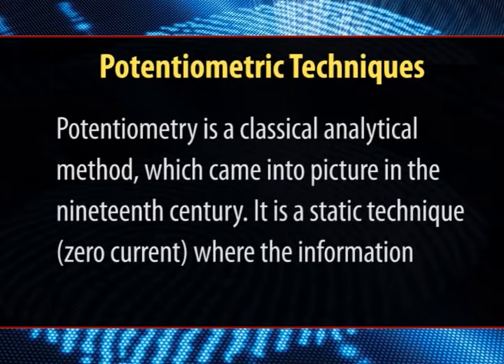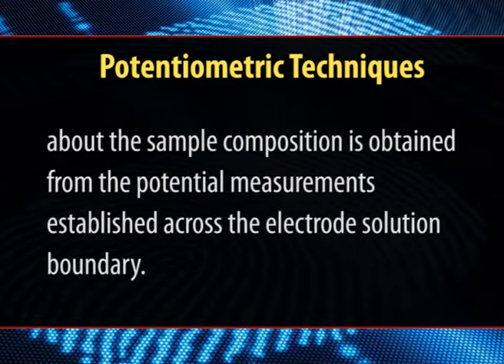Potentiometry is a classical analytical method which came into the picture in the 19th century. It is a static technique where the information about the sample composition is obtained from potential measurements established across the electrode solution boundary.